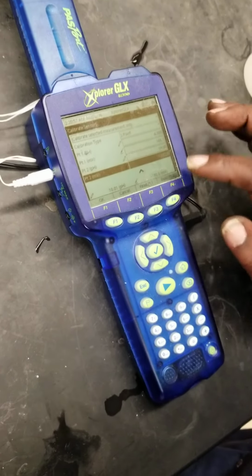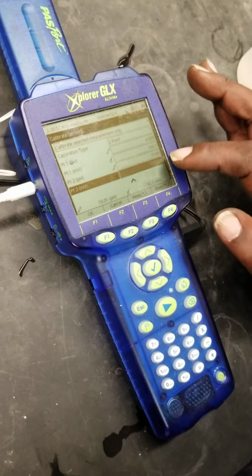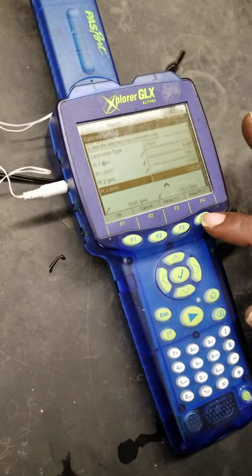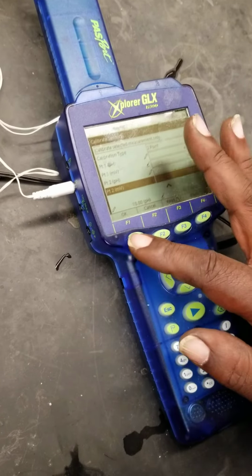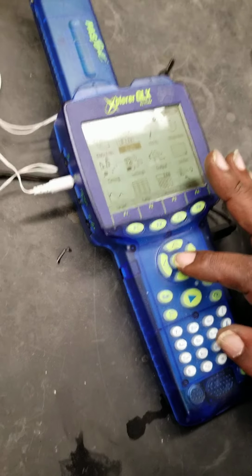So that's the second point. The pH is 10, so that's correct. It reads a certain potential associated with that. And then I say, read the second point. You can't read the first point again because then you're overriding whatever you did before. Then you go, okay, and then come out, and then you go to digits. I like the digit mode.